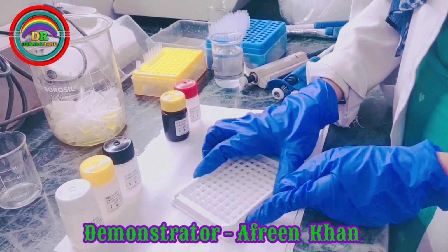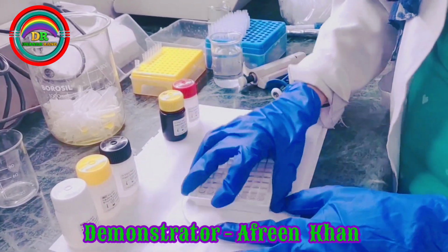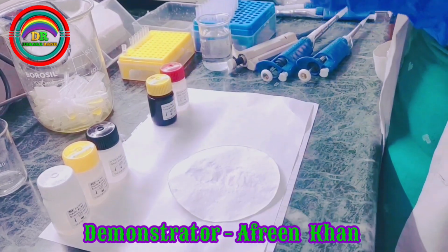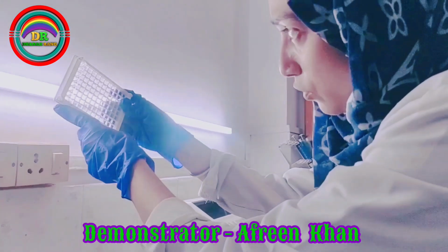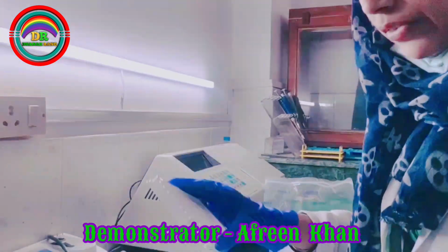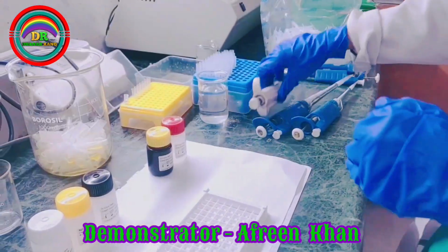Again we'll shake slowly and discard all the contents, and then we'll again tap the microtiter plate against the absorbing paper. Then we'll make sure there are no droplets of wash buffer left in the microtiter plate. So our plate is completely dried. Now we will add 50 microliters of substrate solution.